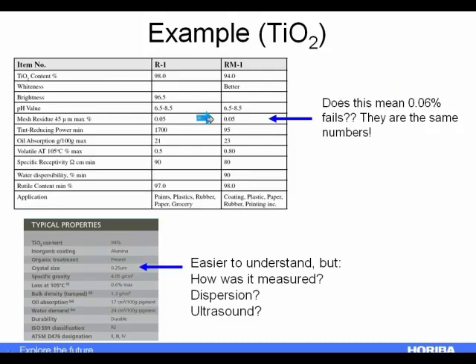So really, as you look at specifications, there really must be or should be internally some kind of also a bracket of the error of the measurement, because the difference between 0.05 and 0.0502 really is insignificant. So we need to consider significant figures in everything in science.